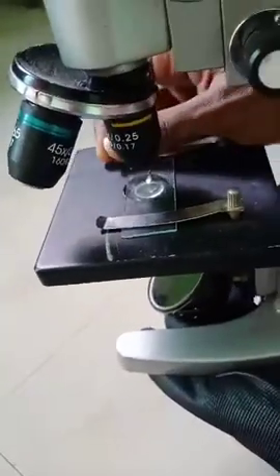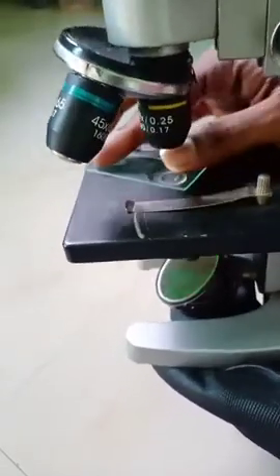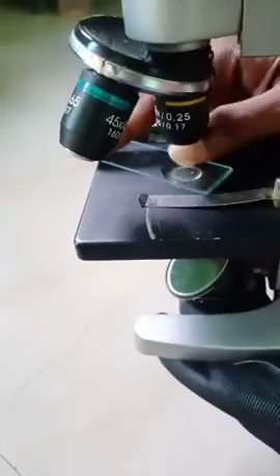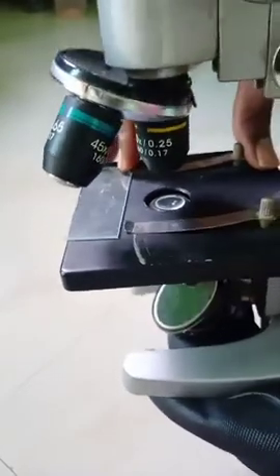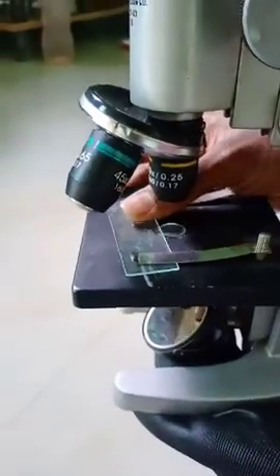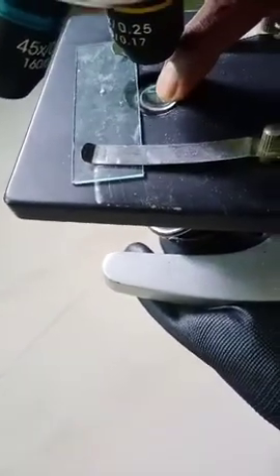And here we have the black color square shaped structure. This is called the stage. On the stage we have one pair of clips. These clips are responsible for fixing the slide in its particular place. While observing the sample, we can fix the slide with the help of these stage clips. And one more special structure we have here. This is called the diaphragm. I will show you towards this side. Yes, this is called the diaphragm.